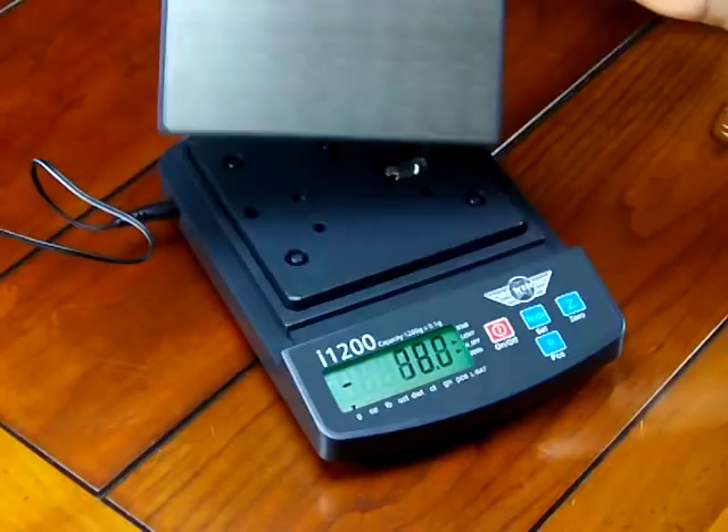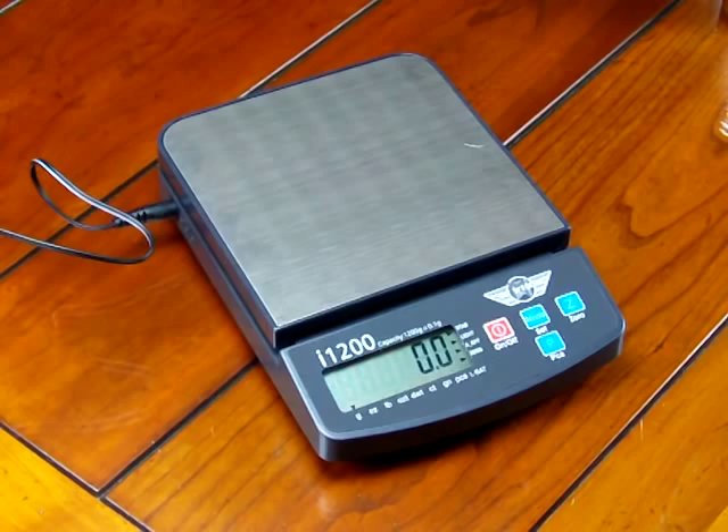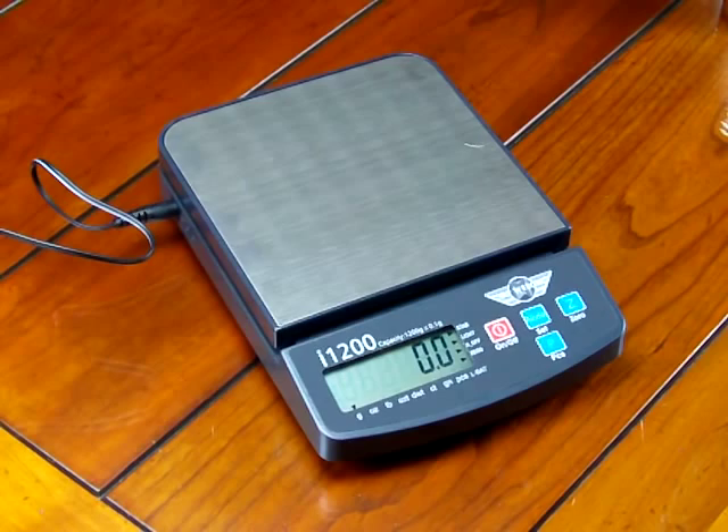The scale comes with a nice removable stainless steel platform for easy cleaning. It's a popular scale for the educational market since schools are looking for the best value possible — trying to buy as many scales for their science laboratory with limited budgets. A MyWay really fits the bill. The scale does not have RS-232 for data acquisition; it's just a simple, basic scale, but it's ideal for the educational market, especially where budgets are limited.